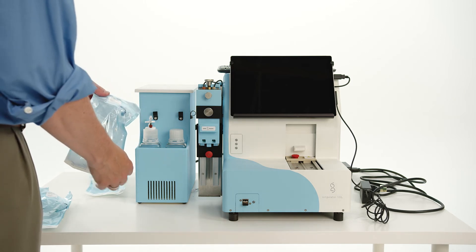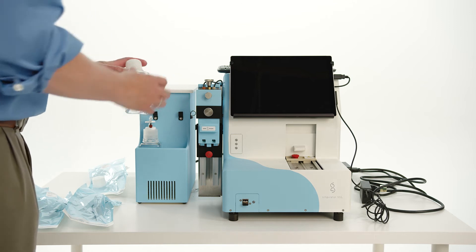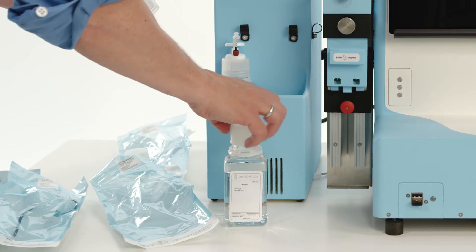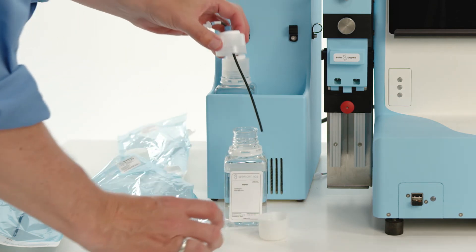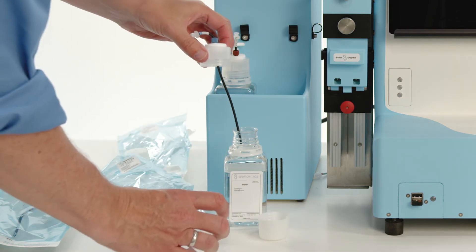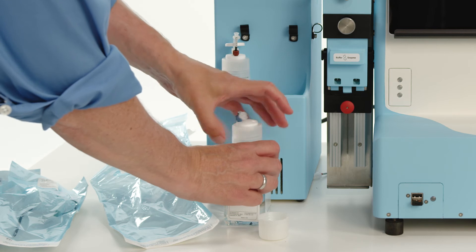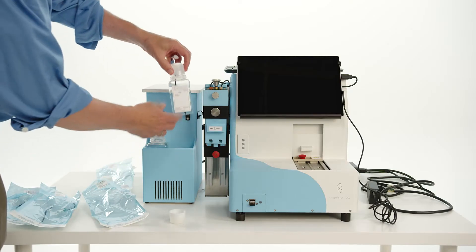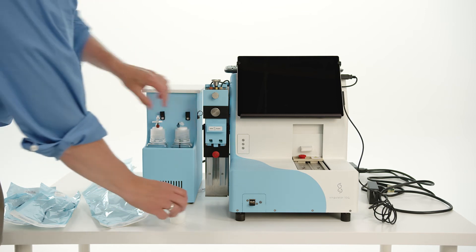With gloves on to prevent contamination, fill the water bottle with DI or MilliQ grade water. Remove the water bottle cap assembly from its sterile pouch. Remove the cap from the water bottle and screw on the bottle cap assembly. Be sure that the Luer lock connector coming out of the bottle cap assembly is blue, and place into the right side of the slot in front of the chiller unit.